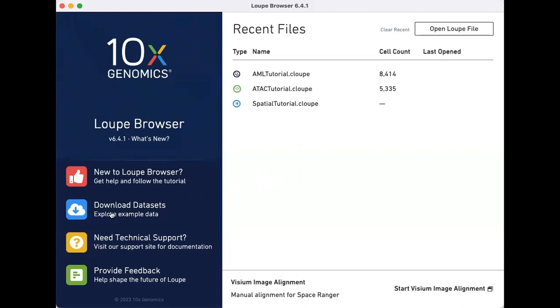In this video, we will use the T cell VDJ beam tutorial dataset to explore the distribution of SARS-CoV-2 and flu reactive cells within gene expression clusters. We will also perform differential gene expression analysis to identify genes that are upregulated in SARS-CoV-2 reactive cells.